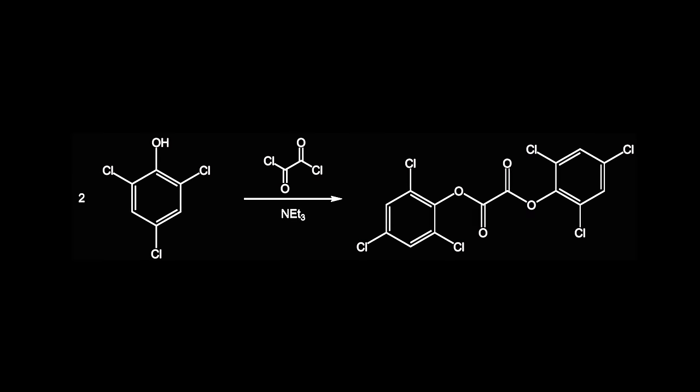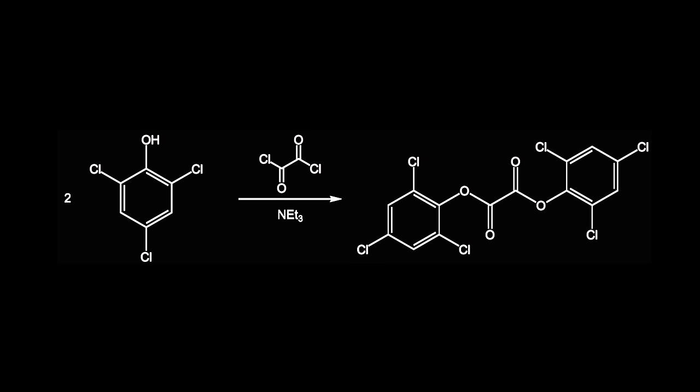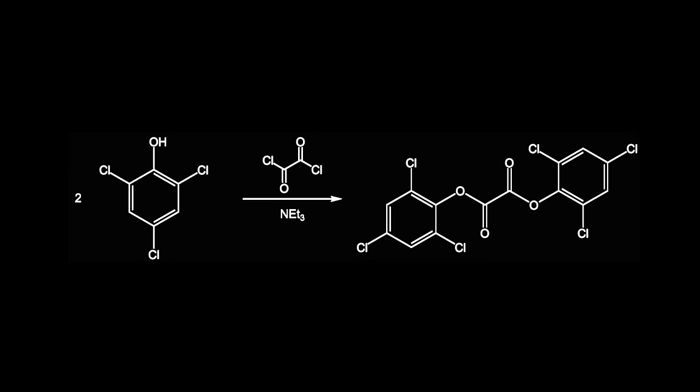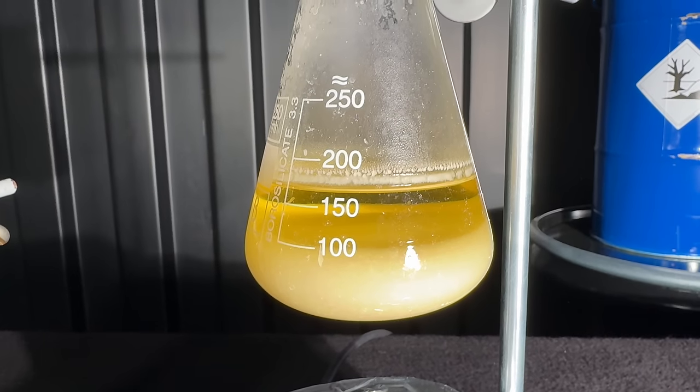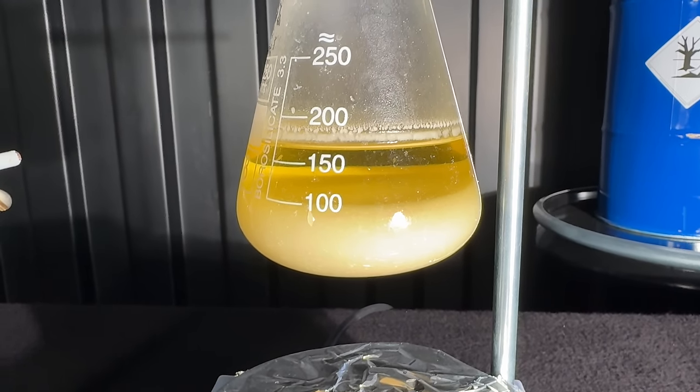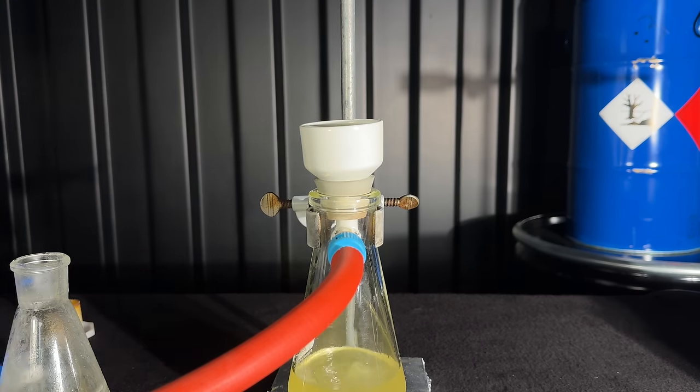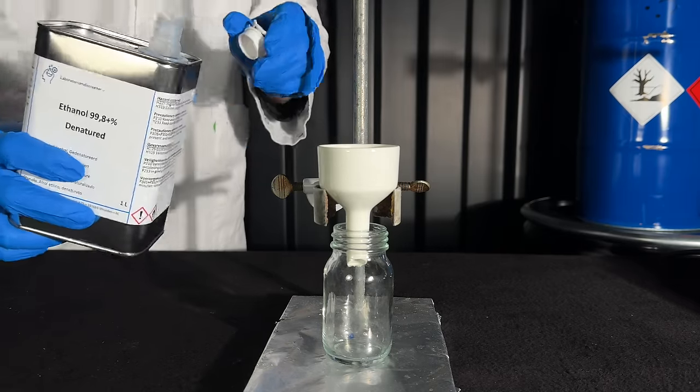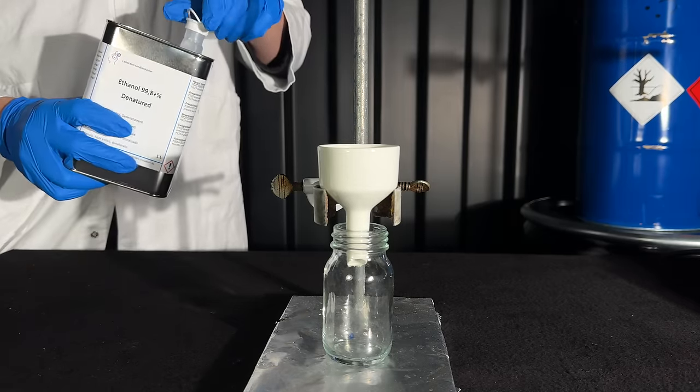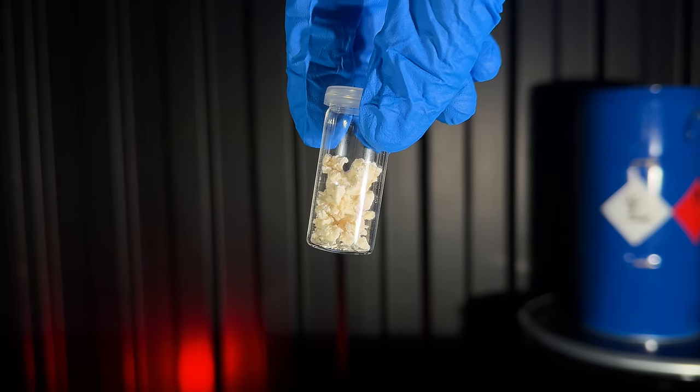The TCP reacts with oxalic chloride to form TCPO and hydrogen chloride. The HCl in return reacts with the triethylamine to form triethylammonium chloride. I let it stand until the next day, because this way you get bigger crystals that are easier to filter and then I filtered it. To get rid of the triethylammonium chloride I did two washes with ethanol. Once dry the yield was 2.17g, which is about 48%.